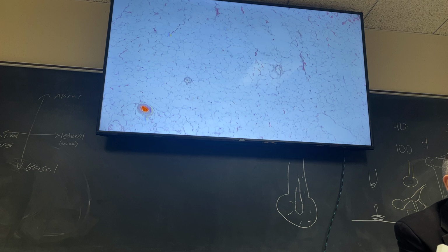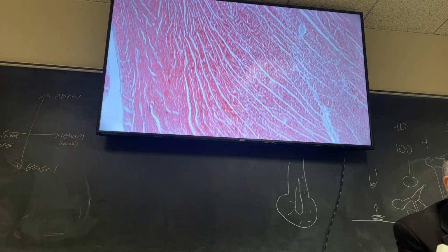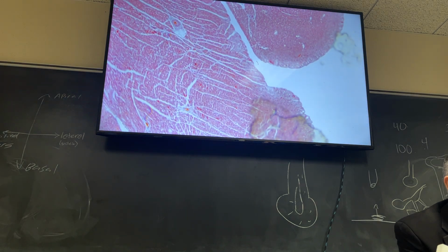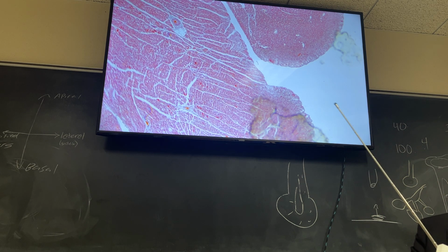All right, so let's get away from that and go look at Purkinje fibers. Did you find anywhere where there are weird spots? I don't care where I pick, let's pick somewhere. Anywhere looks good to me. All right, let's do this view. There's a couple of weird things on the slide, but don't worry about those. There we are, now we're in focus. That's just weird stuff, right? So, where do you see some cells that look weird? The dark red ones.